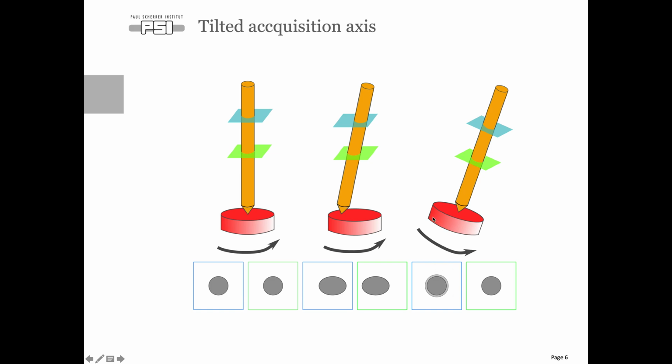The worst case is when the sample table is tilted, and then you can tune as much as you like on a single slice. It's perfect. But if you move like 100 slices up or down, then all of a sudden you have the ring of uncertainty like you had if it was off center. So that needs to be corrected, and I'm going to show you how to do that soon.